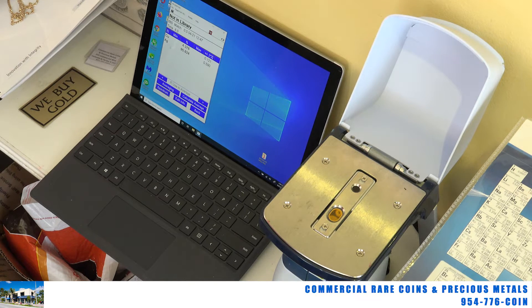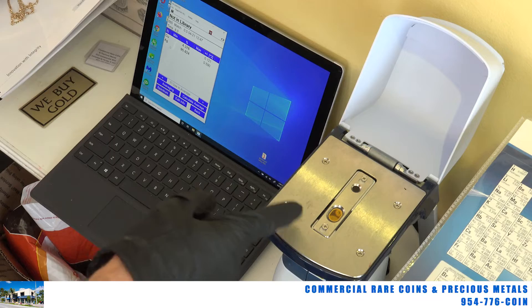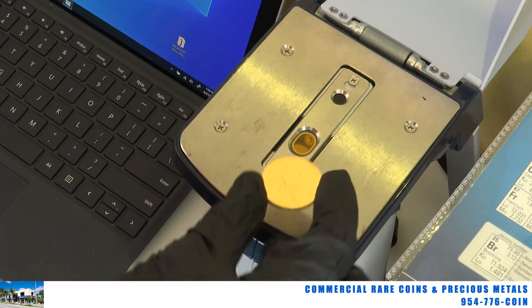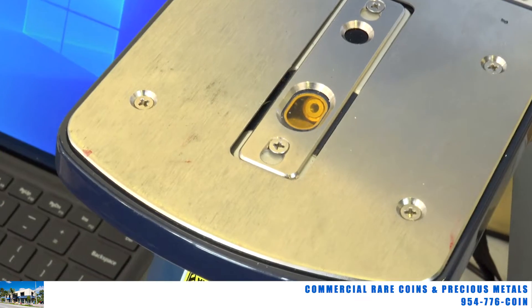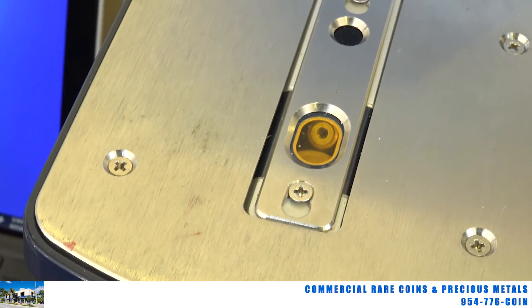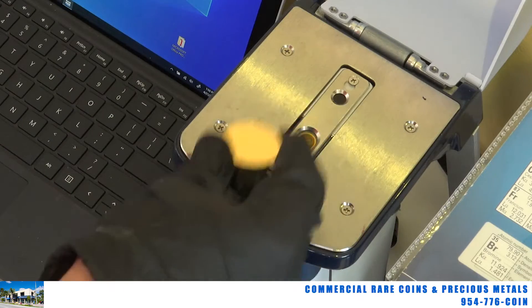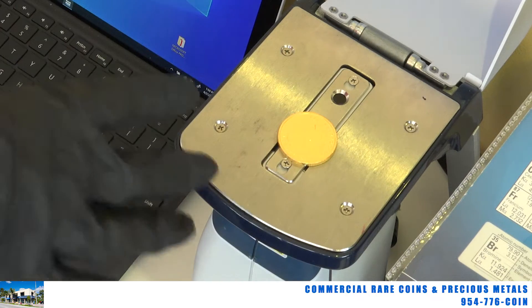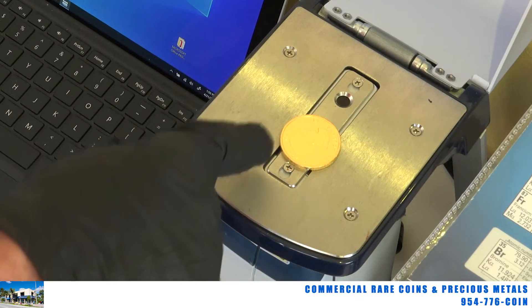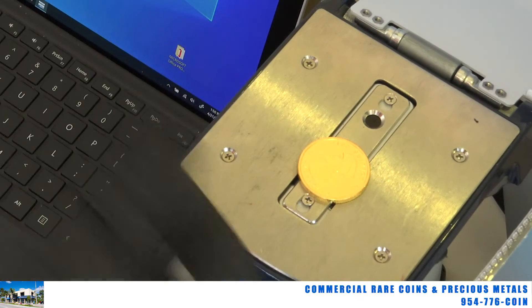This machine only detects the surface. It reads the surface of the item within maybe 10 microns of whatever you place on it. So if I put a gold coin on it — for example, this gold 999 maple leaf — over that little window, there's a tube device that shoots an x-ray type ray at the surface of the coin, it bounces back and is detected. What it detects are the elements on the surface, within 10 microns — not inside the item.